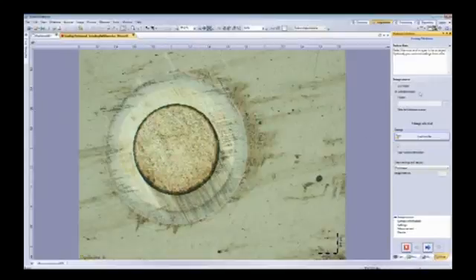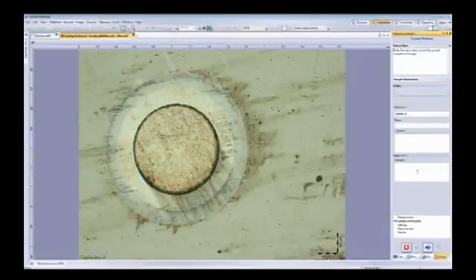Exactly. All of these solution modules work as a workflow, with just next buttons. They all give you instructions at the top. We hit next here. We can type in a lot of information for our samples. Customers are usually going to have hundreds of these pictures that they'll want to process, and this solution module can batch process those. All of our solution modules can do batch processing. And we hit next here.